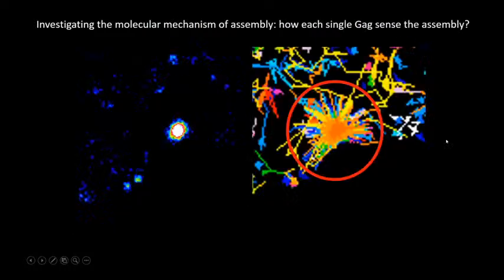While performing this, on the left is the density of the positions over the whole time of the acquisition, and these are the tracks. We started to observe some striking and interesting tracks that seem to be directed towards the high density positions.